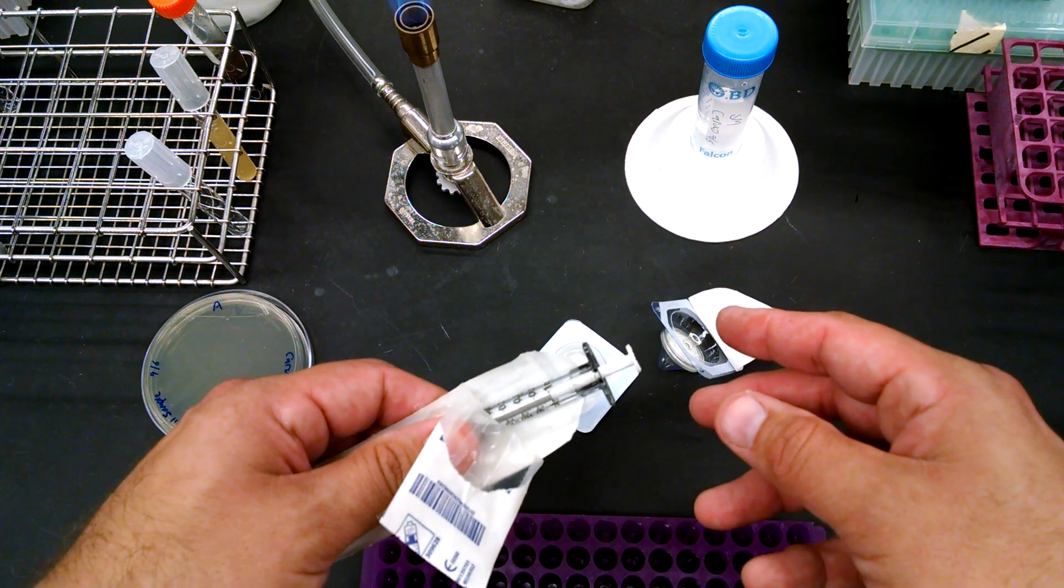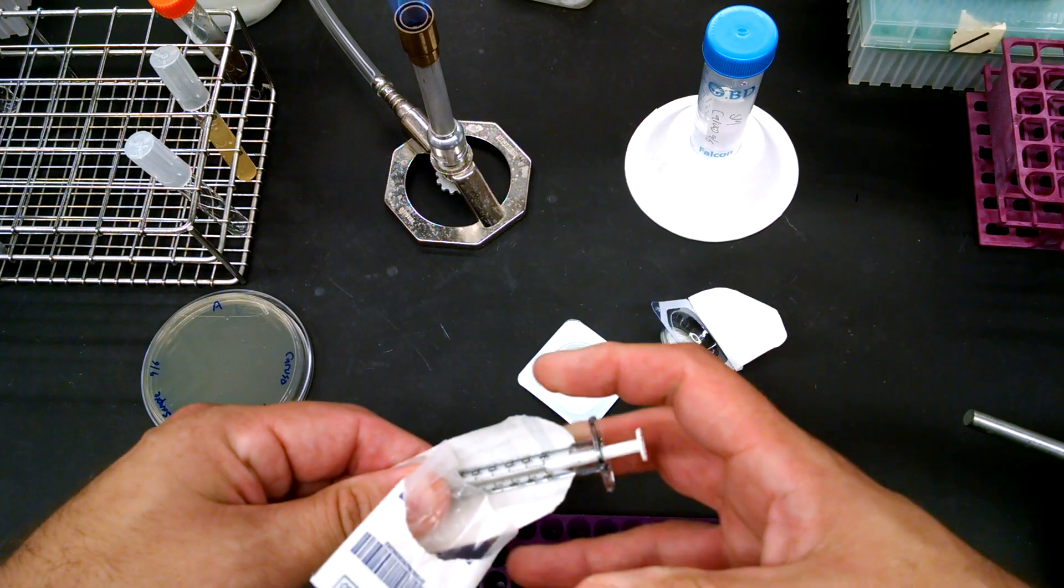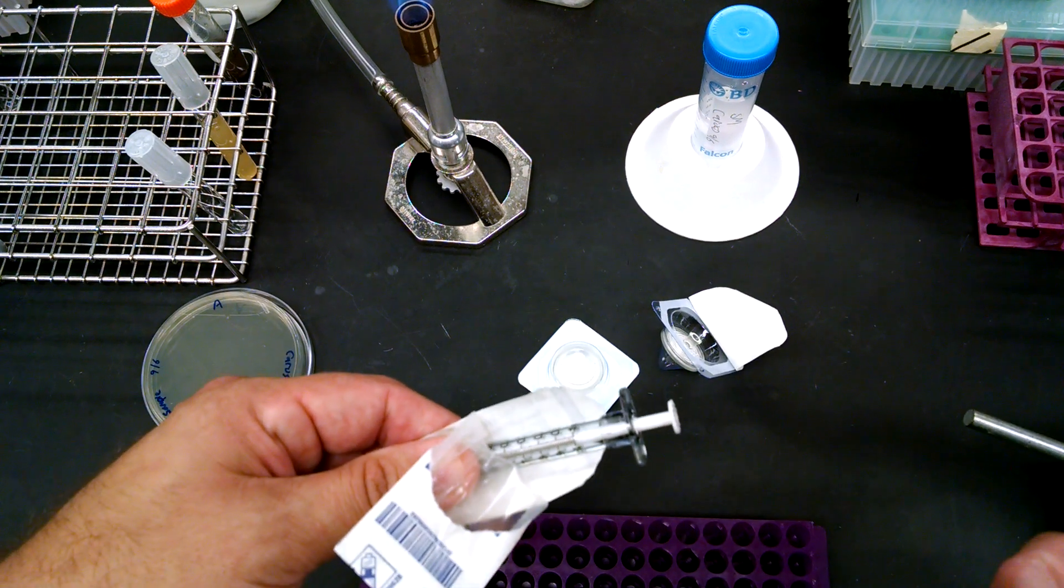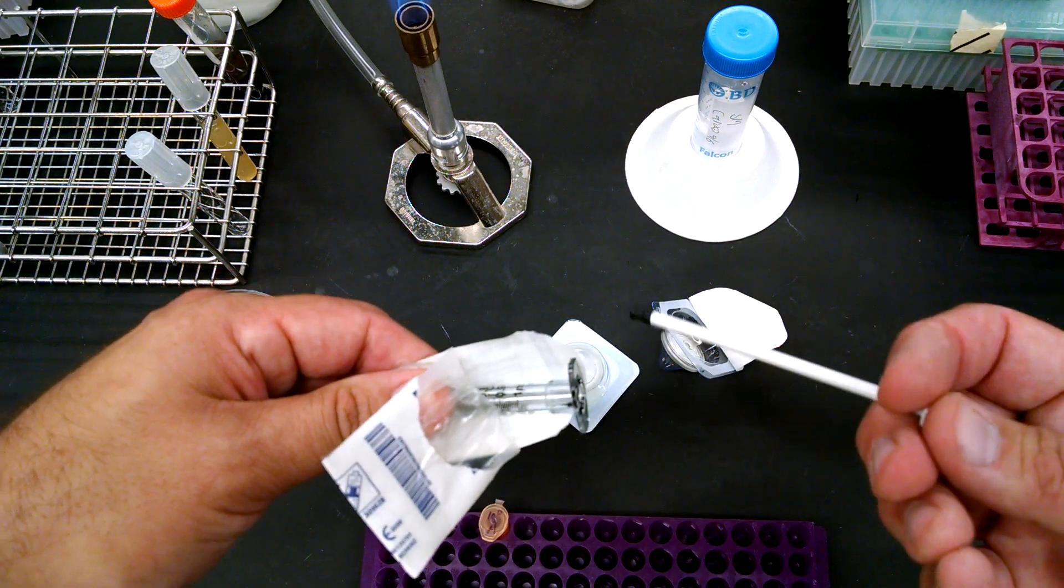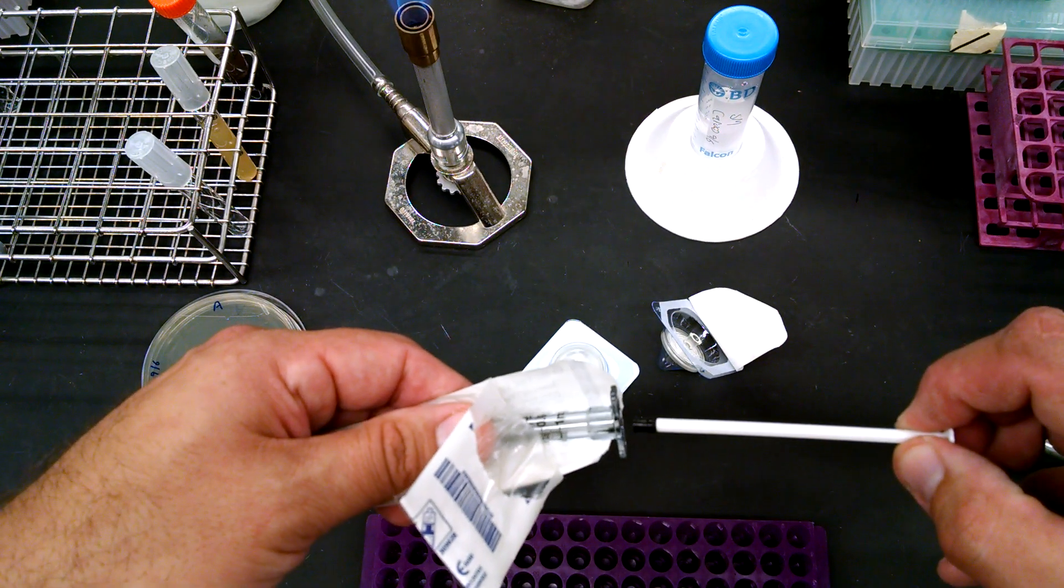What you don't want to do is attach it to the filter right away and then yank out the plunger because that'll put negative pressure on the filter and it'll rip a hole on the filter. Never have this attached to the filter and then pull out the plunger. Whenever you're going to attach it to the filter, make sure you take the plunger out first.